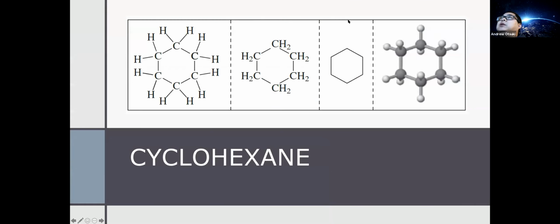So you're going to be building chair cyclohexanes. You're going to visualize what we actually taught you, that this planar structure of a cyclohexane is actually not the most stable, and you'll see yourself building the chair conformation, and explaining why it is important, and whether it is really the most stable conformation.